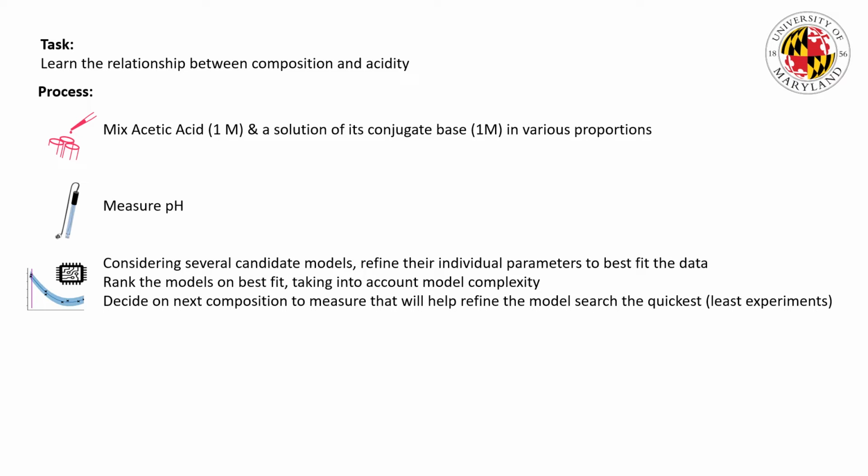In this process, for synthesis, the robot itself will mix liquids of acetic acid and a solution of its conjugate base, all in low concentrations that are safe. It will then measure the pH using an Arduino pH probe.